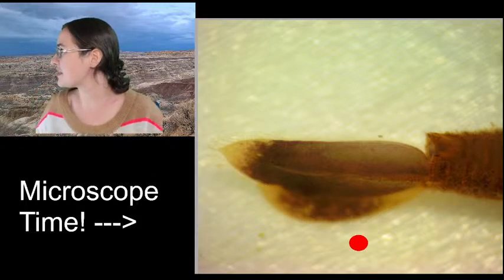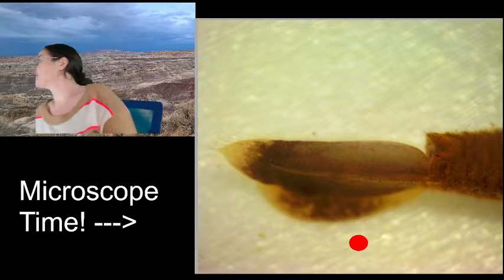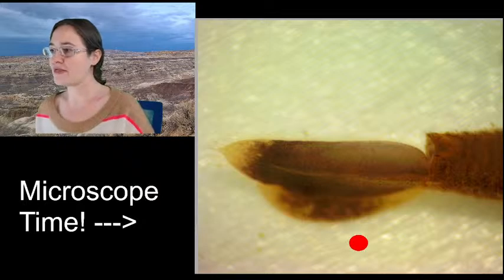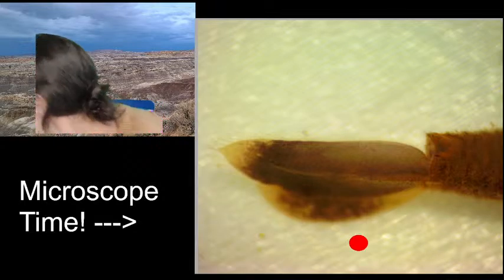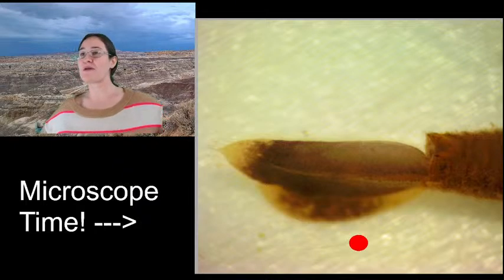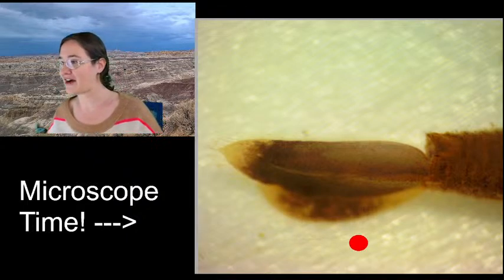So I purchased the Amscope microscope and the Amscope camera separately. I'm running an MU1000, the Amscope MU1000 USB mic, and that's probably a question that more people are going to ask, so I will make sure that I look up the numbers on my microscope, just in case you guys want to check it out.